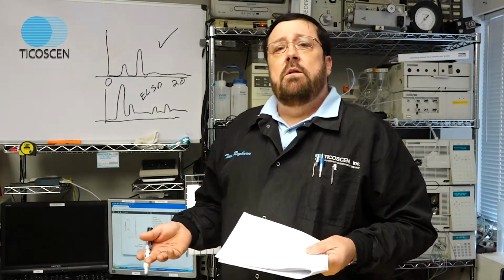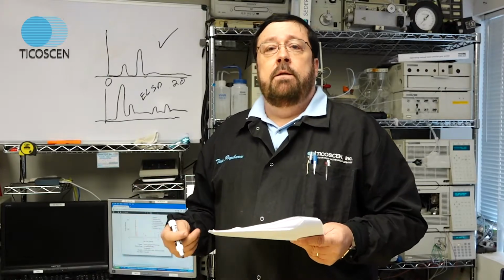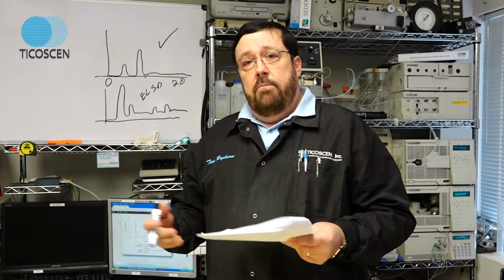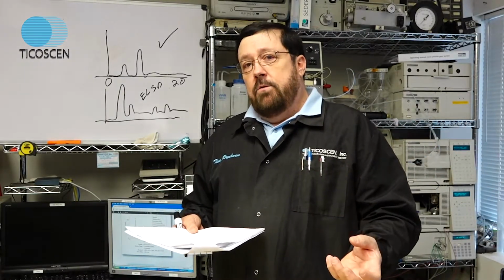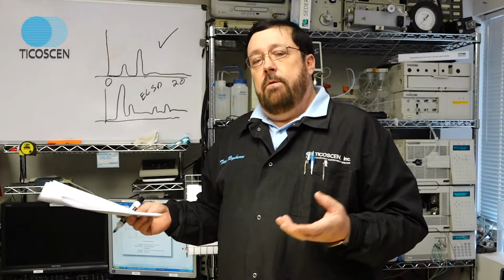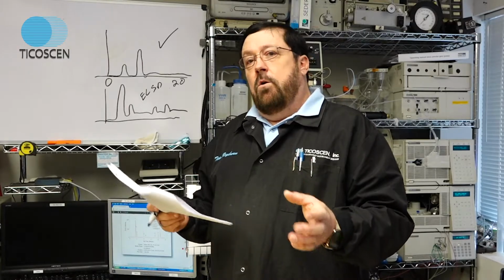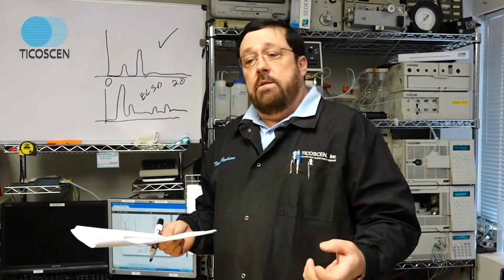So they need to look for purity of the lipid, the abundance of the lipid, from the raw material stage when they get the raw material to make the lipid to the final product when it's encapsulated. And then they do a thing called stability testing over time. They'll store samples of each production batch and they'll go back every year and retest it to see how stable it is over time. Because a lot of products have a shelf life and they have to test them for stability. And they're still non-chromophoric compounds.